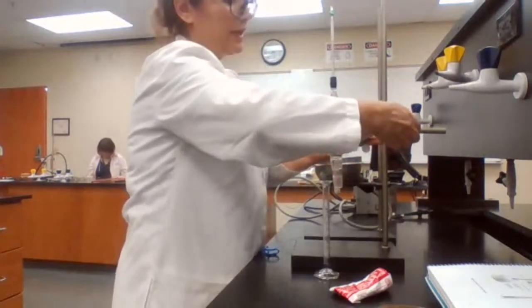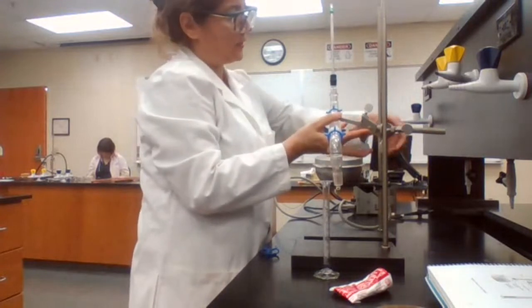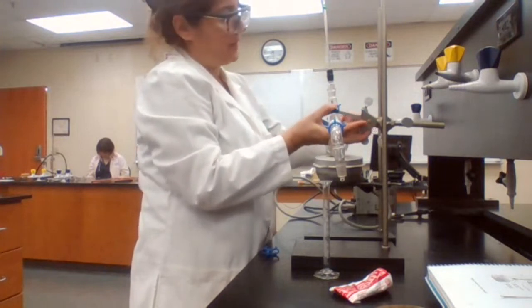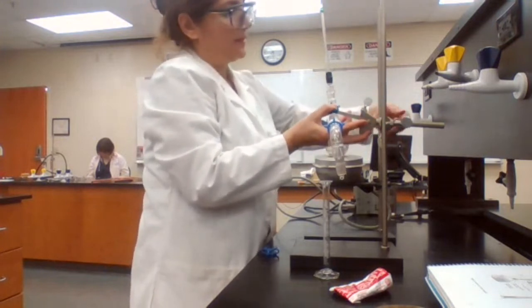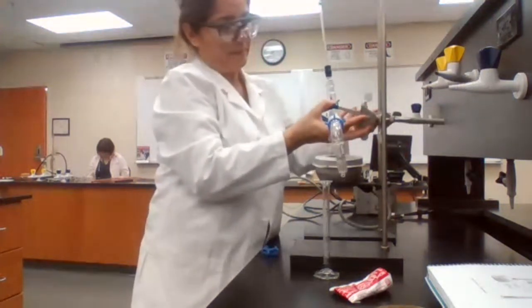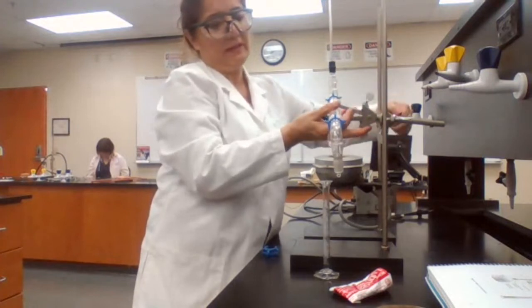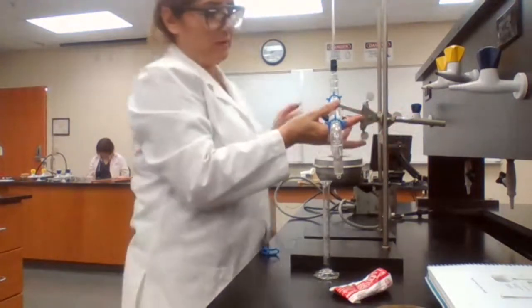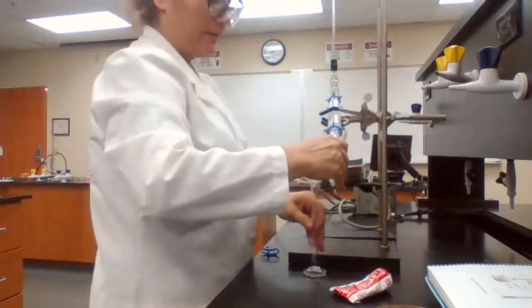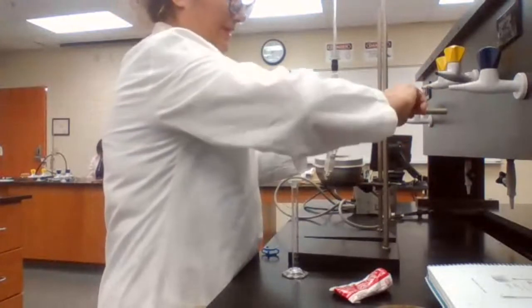And when you are working in a group, when we have 2 people here, it's easier, because you can get help from your lab partner. If not, you use both hands and move it up, then secure it. It has to be aligned, not too high compared to the height of the graduated cylinder. So what is the problem?